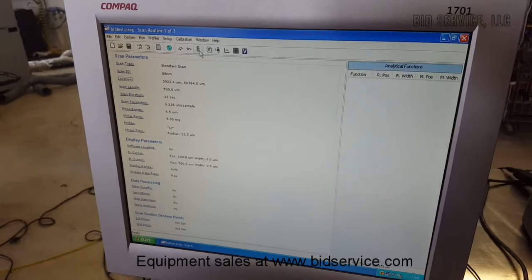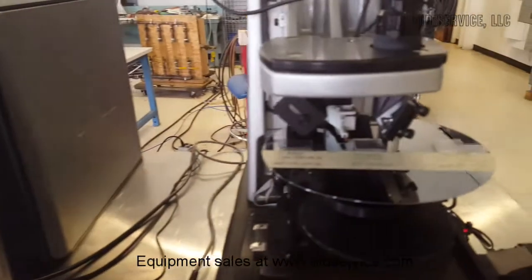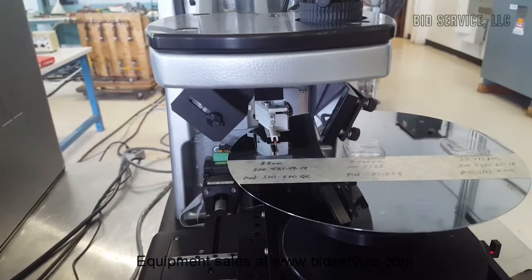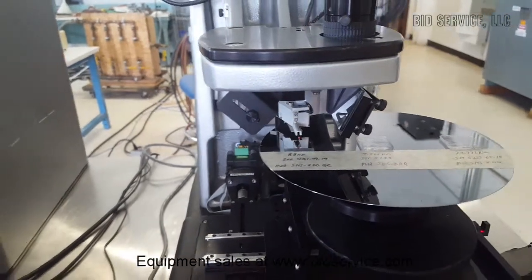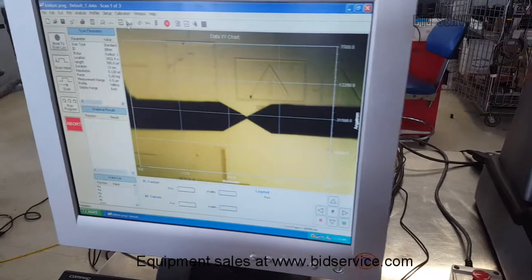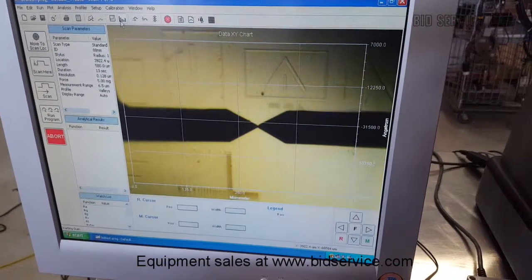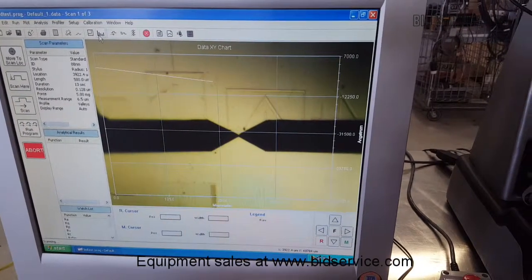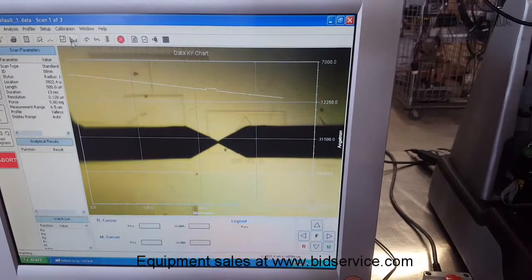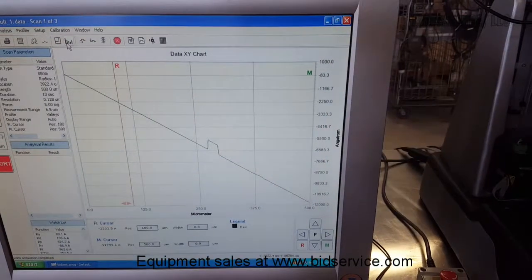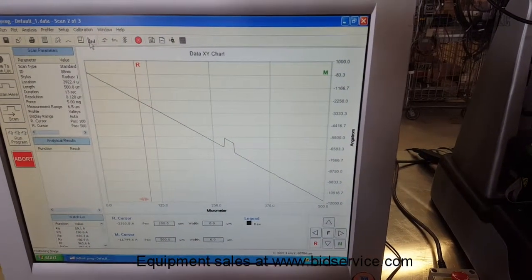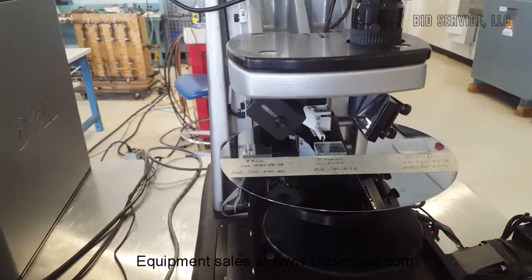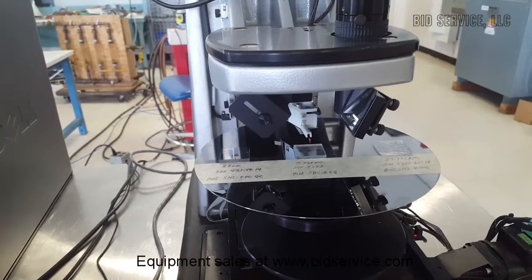I'm going to run the automated program. Now the first standard there is 88 nanometers. This unit has the optional XY motor controlled stage, so the second standard is going to measure 7.858 microns.